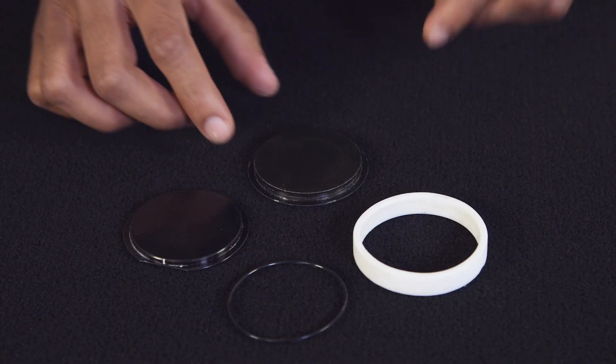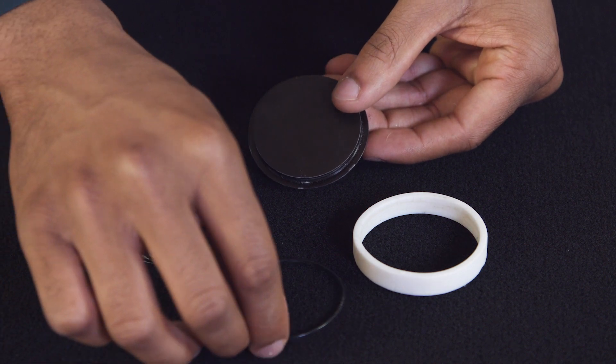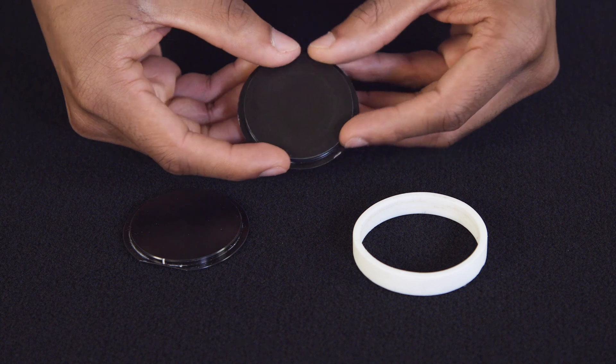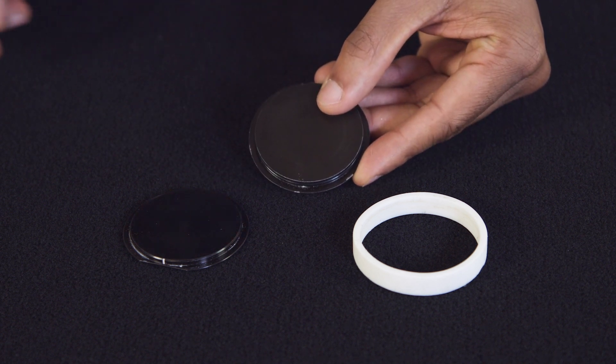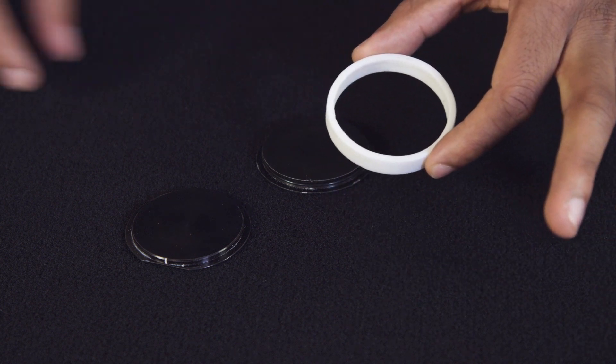To put the cell together, start with the bottom plate. Seal the bottom plate around with the o-ring — this will prevent leakage during testing. With the o-ring seal now on the plate, place the ceramic ring onto the bottom plate to create the space that will encompass the liquid.